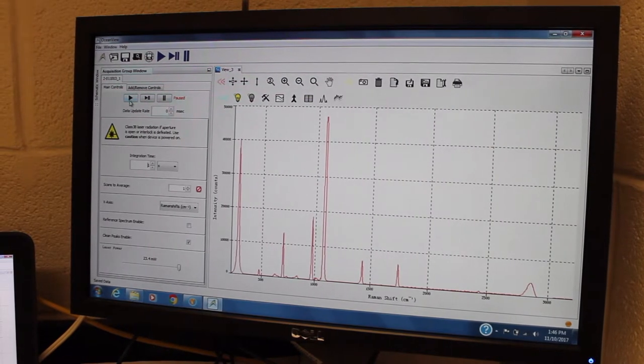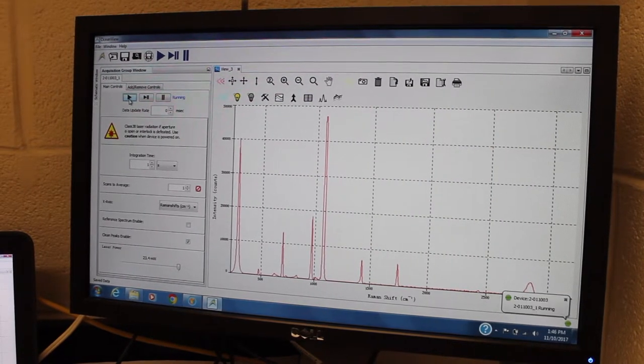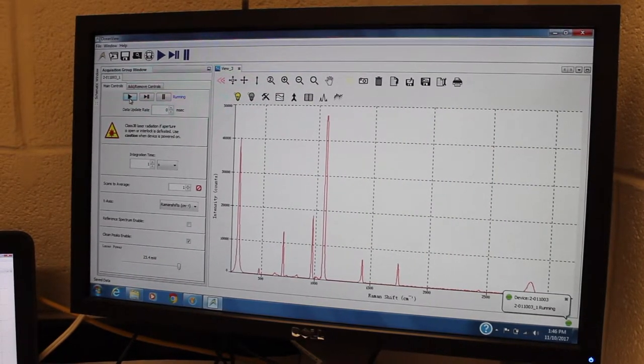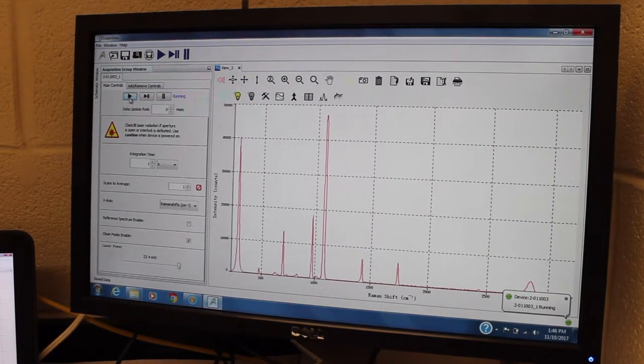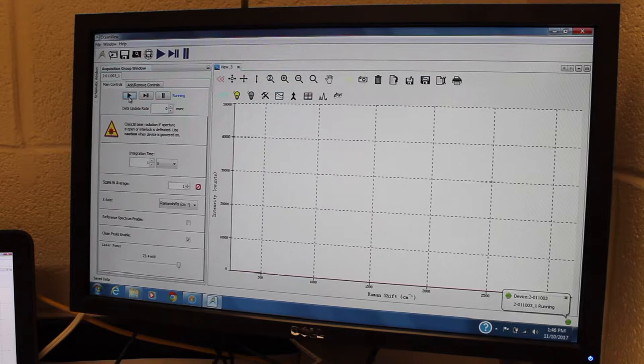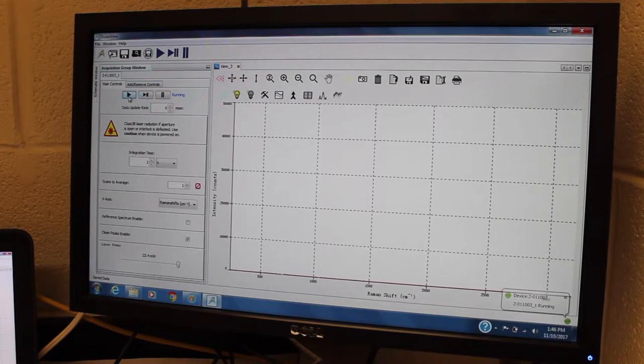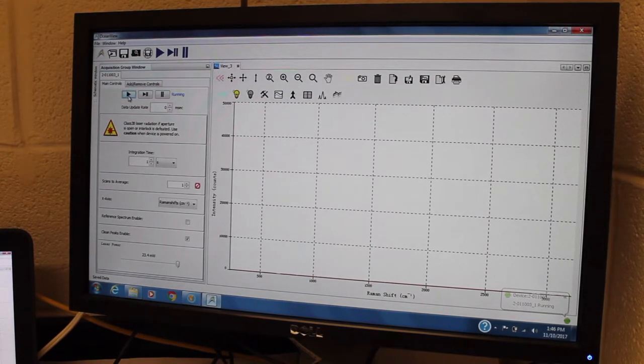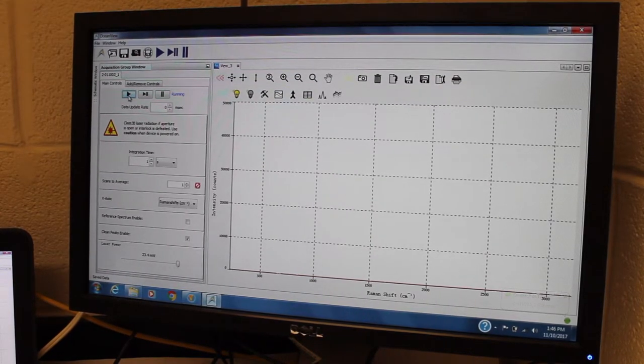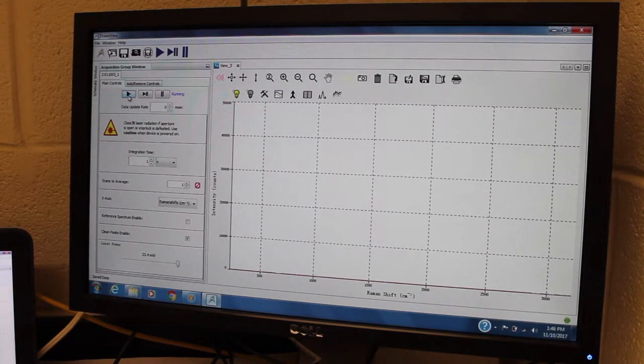I'm going to take some data. I'm going to start running. Oh no, why is there nothing there at all?